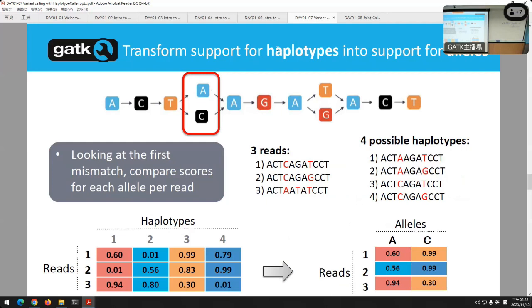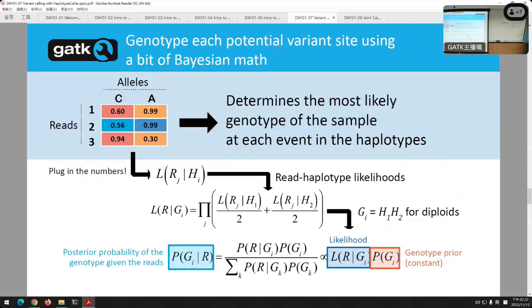And I'm going to throw this into our math. I'm not going to make you understand every bit of detail of the equation, but this is simply Bayesian mathematics. It's Bayes' law. I'll jump down to the bottom to start with. Bayes' law gives the posterior probability, and that adds up to 1. The posterior probability is just the prior probability times the likelihood.